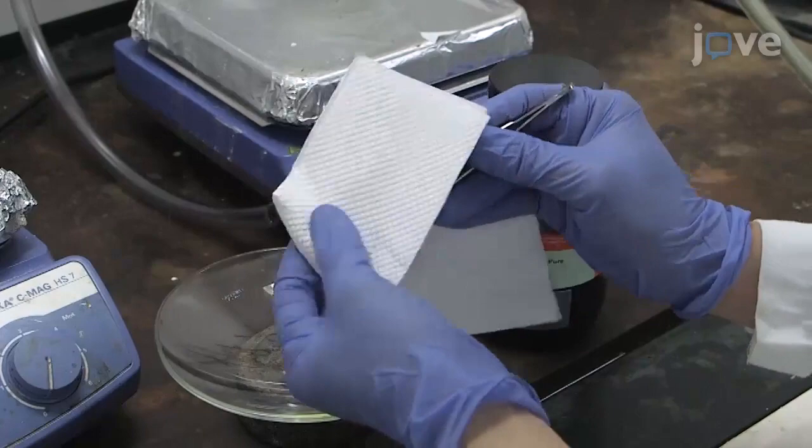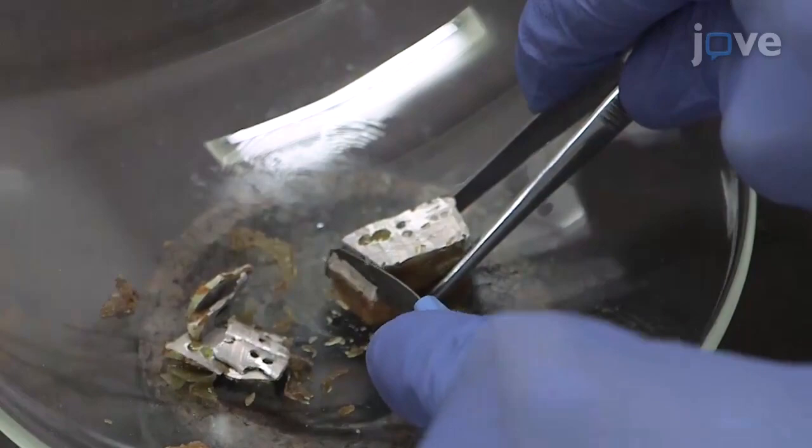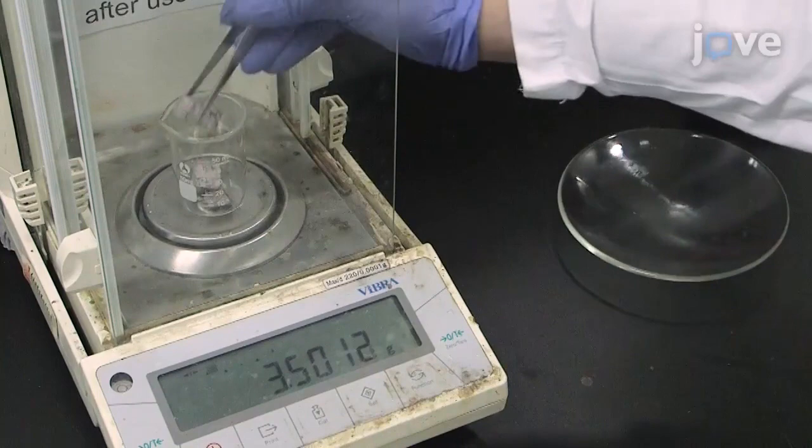Wipe away residual mineral oil with a paper towel and scrape off the oxide layer with a knife. Quickly weigh out approximately 6.7 grams of metallic sodium and note the weight.